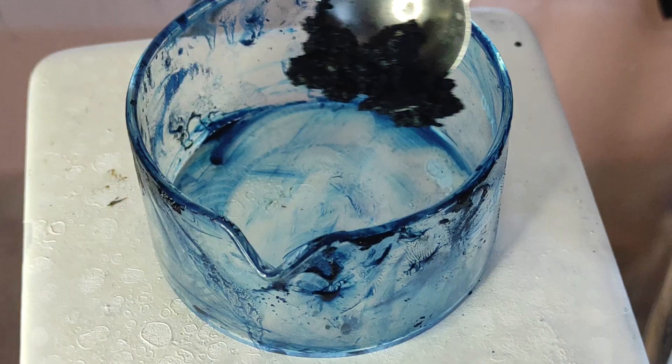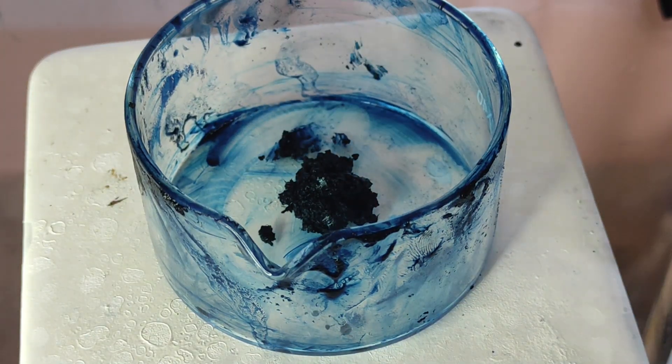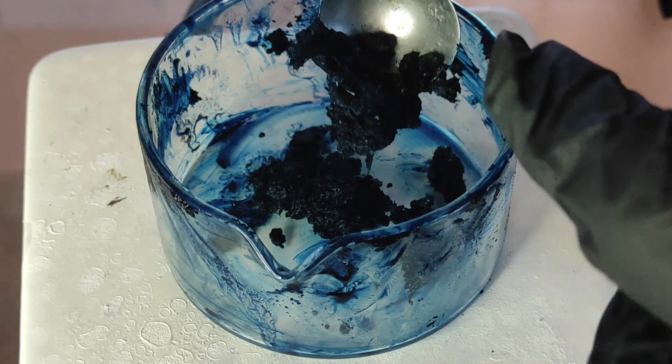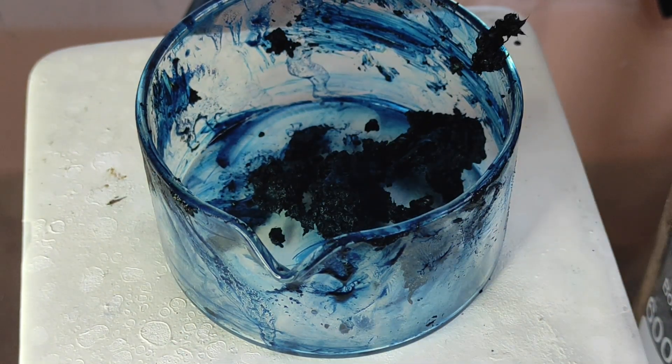After it has finished I started scooping up the Prussian blue from the filter. As you can see the pigment is still a little wet but that's really good because now we can draw with it.